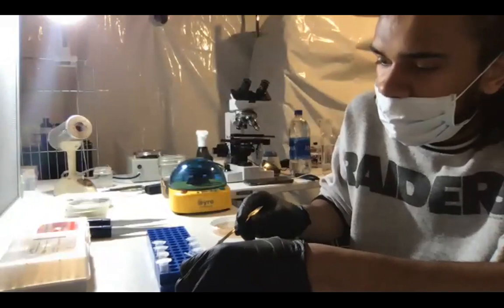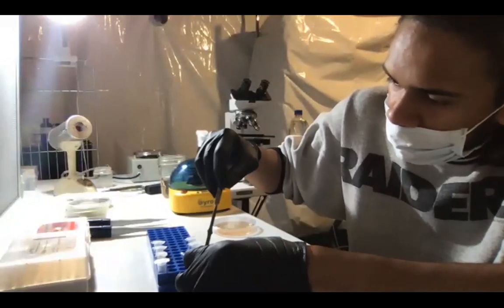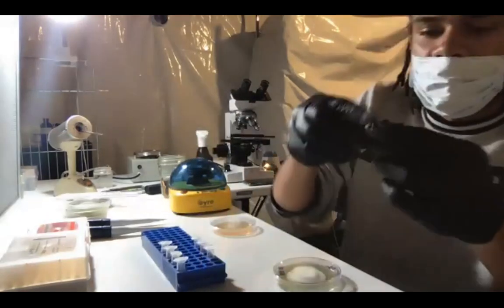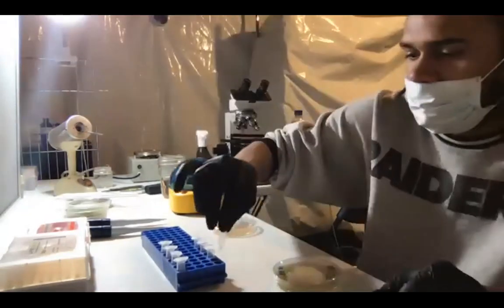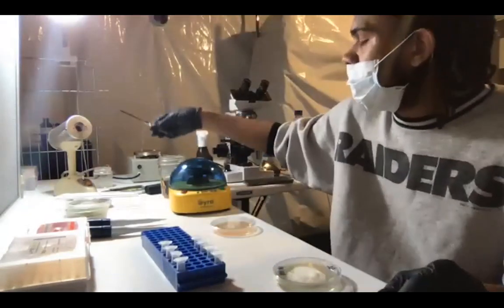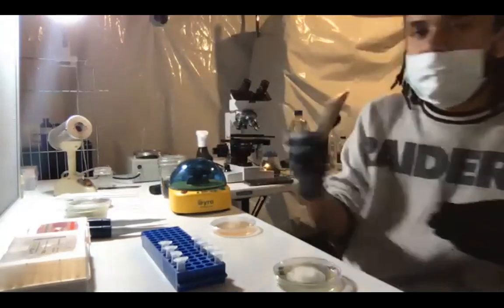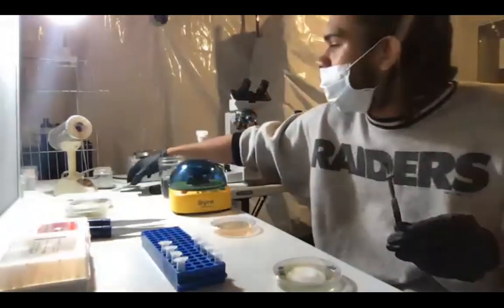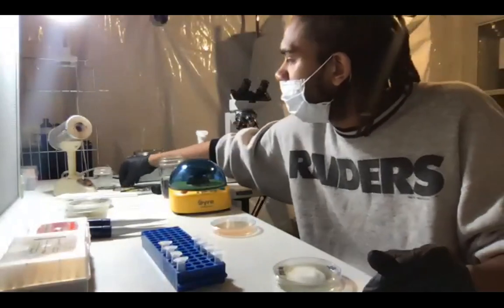I'm gonna go ahead and drop that right into the tube and close it. You don't want these tubes open if they don't need to be open. So you can see there's a little piece of the mycelium in there. I have a little ceramic coaster over here that I can set my hot tools on so they don't burn my table.